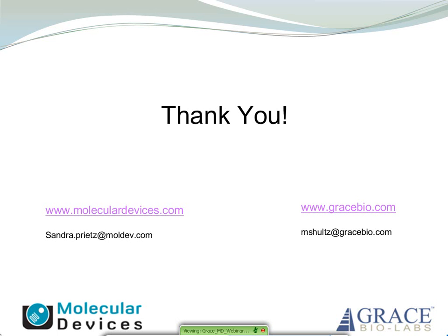Sandra, do you have anything to add to that? Well, it's a great answer, and it's also a very good concern of the attendee that asked about the confocal system. It is really very important to have the right choice of scanner or the right optical system to read out the signals, so that you're not running into the problem with uneven data or intensity that drops across the slide. And I think there are mechanisms to compensate for that, but it is for being in the same plane of focus, not being able to dissect the signal from the background on a microarray slide. It is very important to have a depth of field as we have in a non-confocal system. So I think that should be answer enough.